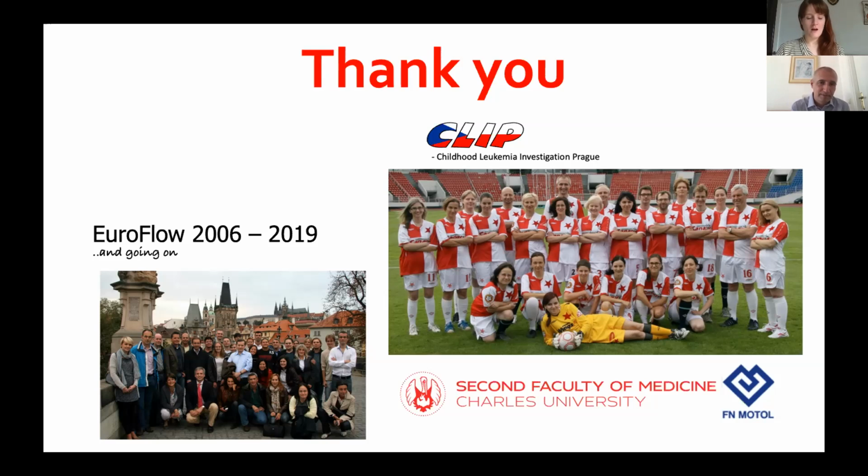Great, thank you. And then one more question for you, just to wrap it up here. When talking about specificity of the antibodies and binding to specific epitopes on the surface of cells, one of the things that I think of at least is the dissociation of tissue or cells and the impact of certain reagents on those surface epitopes. So just a general curiosity question, do you have any preferred reagents for cell dissociation, or is it very much tissue and cell type dependent?